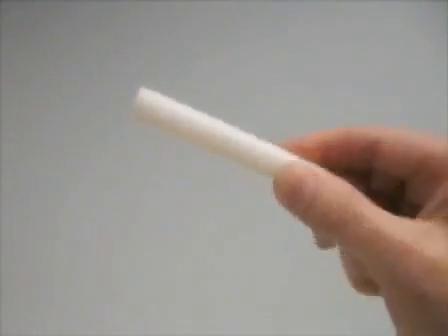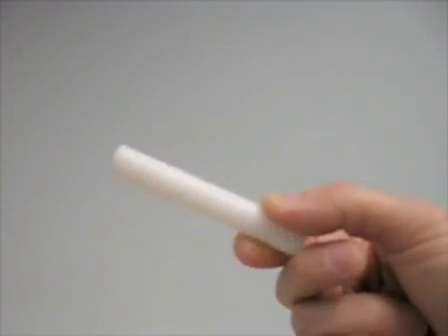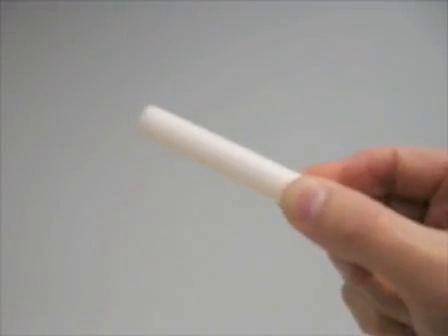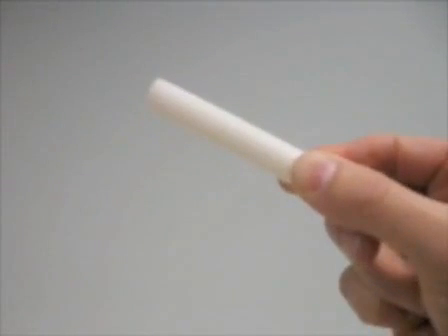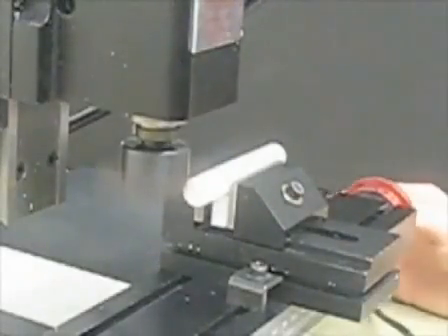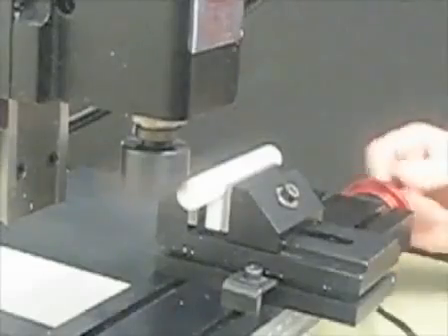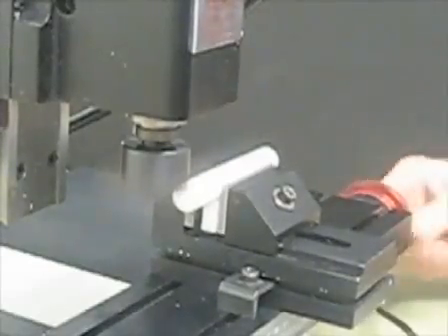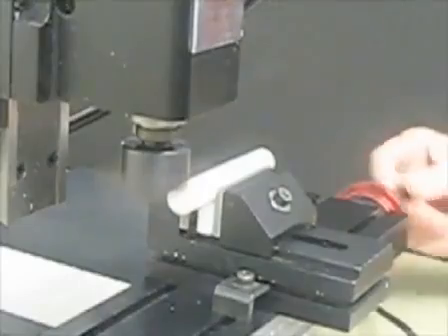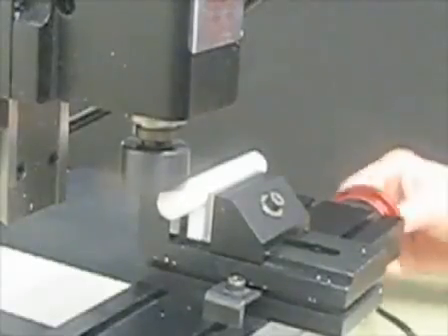To make the stimulus pieces, we started with 1/2 inch diameter, 3 inch long Delrin rods. On a Sherline mini milling machine, we used a fly cutter to plane both ends, reducing the rod length to 2.75 inches. We used the fly cutter to shape 2-inch long rectangular shafts, 8.7 millimeters square.